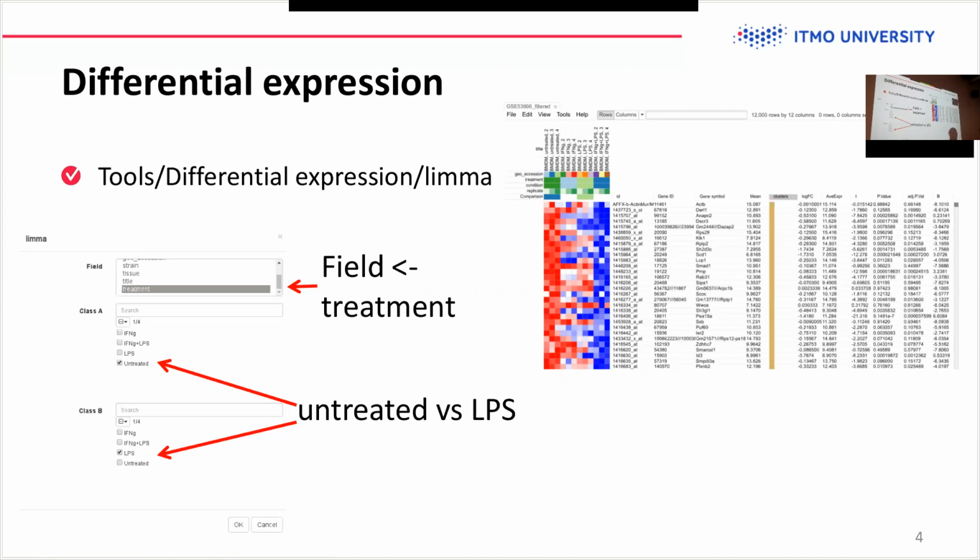One of the features of Phantasus, why we like it a lot, is that this type of analysis is very hard to re-implement in any other language. So that's how we interact with actual R packages without redoing all the code. So yeah, let's do this.